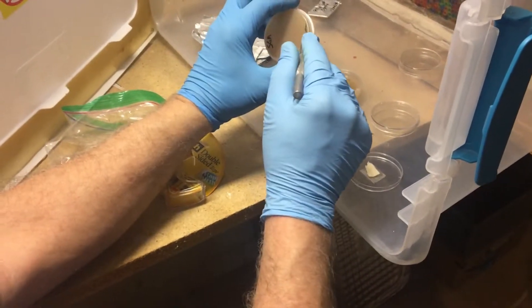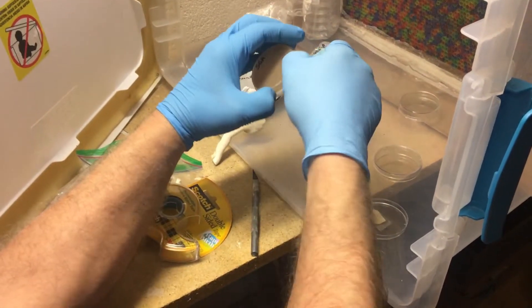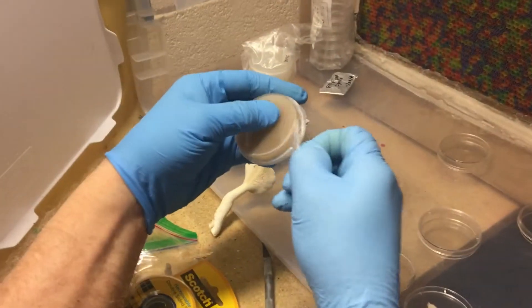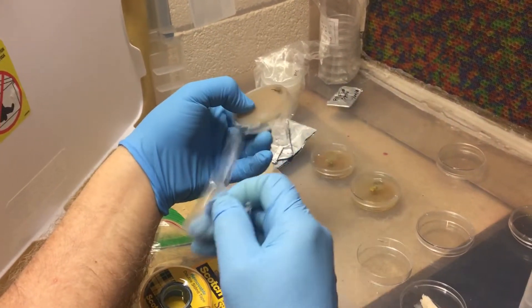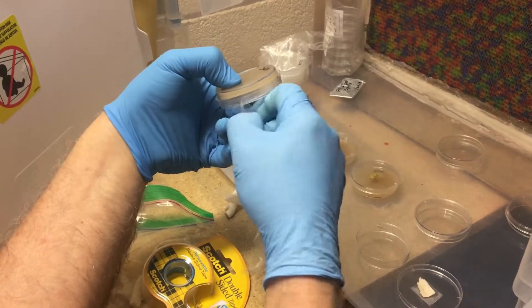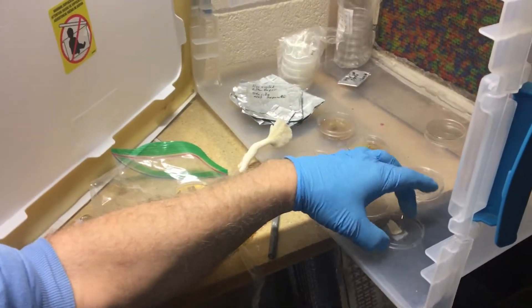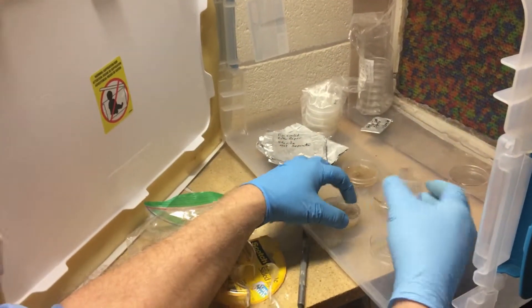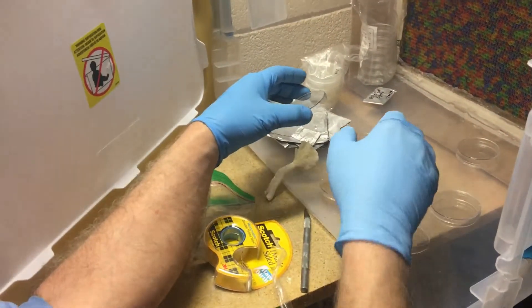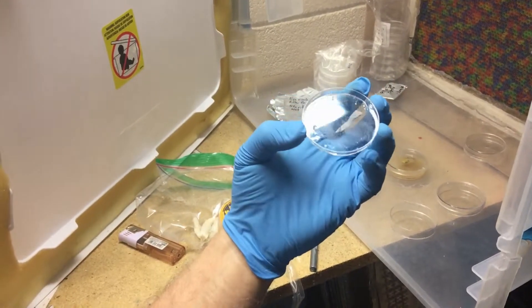At that point I can open up my agar. I'm using spore generation agar, but potato dextrose or CMC would probably work just fine. One of the reasons I use a separate lid — basically a clean petri dish — is that, at least for me, every time I make agar it tends to get a lot of condensation on the lid.